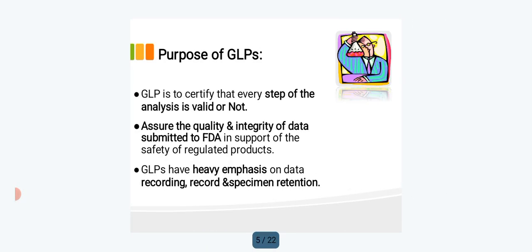Next, the purpose of GLP. GLP is a certificate that every step of the analysis is valid, assuring the quality and integrity of data submitted to the FDA in support of the safety of regulated products. GLP has a heavy emphasis on data recording, record and specimen retention.